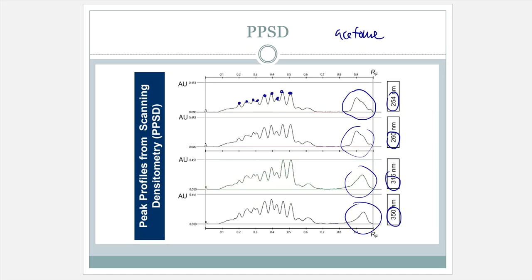So this is a peak profile. This is what we refer to that as. We do not call it a chromatogram per se, but we call them peak profiles. Every lane will have a peak profile. And that peak profile is originated from the multiple components that are inside of your sample that you have an analysis run of. If I was doing a clean standard, guess what? I would see a single peak, and that would be it, because only one thing should be there. It's a standard. Only one RF should be present because it's a standard.